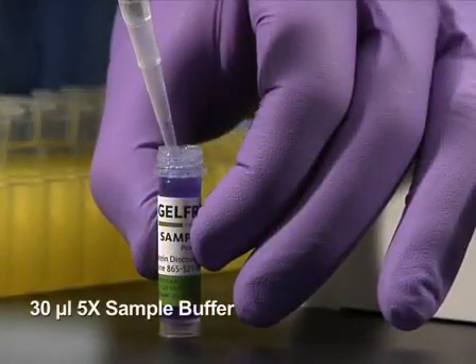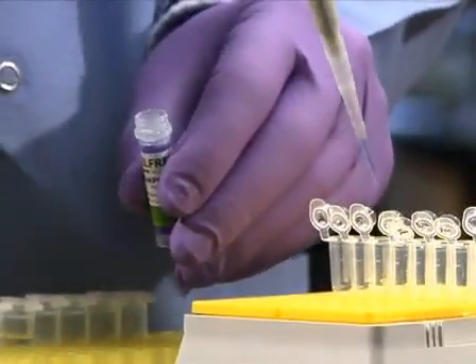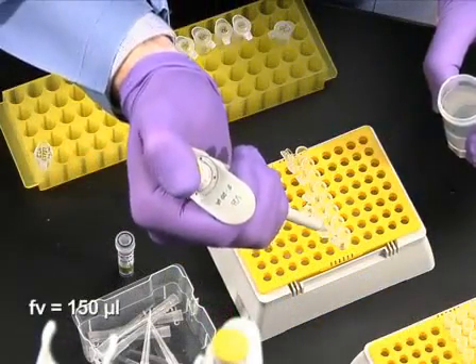Next, add 30 microliters of 5x sample buffer, which is provided in the GelFree cartridge kit, to each protein sample. Add 8 microliters of one molar DTT, then adjust each sample with water to a final volume of 150 microliters.